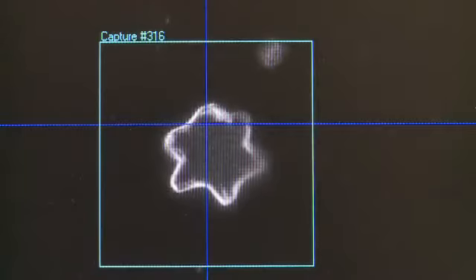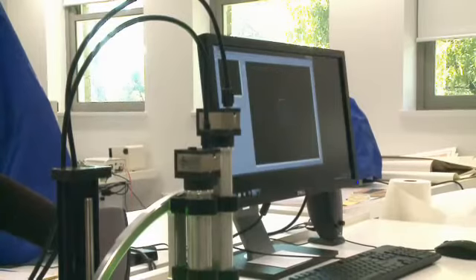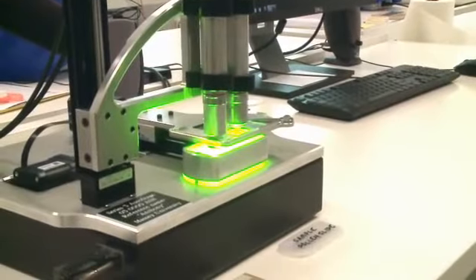The pollen microscope is an instrument that was developed by Massey University in New Zealand to automatically capture images of little pollen grains on slides, to make measurements about those images, and that will allow you to identify the type of pollen that particular grain belongs to.